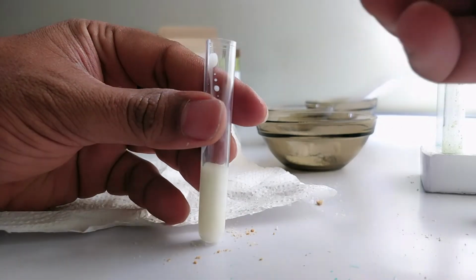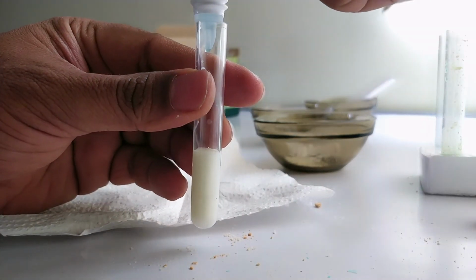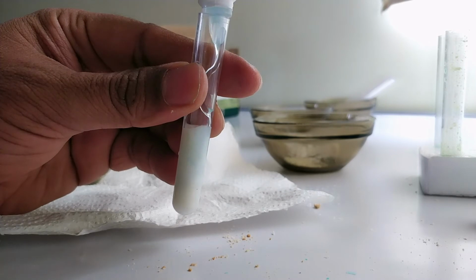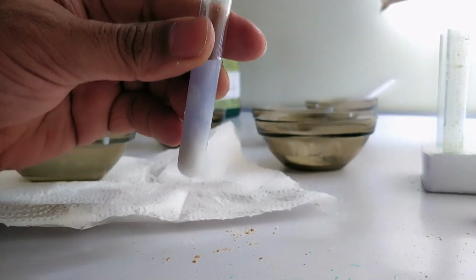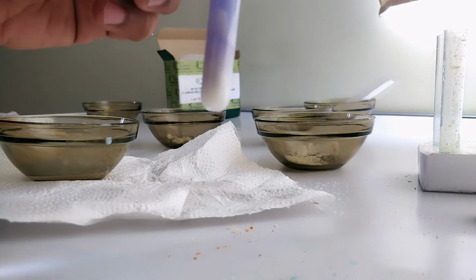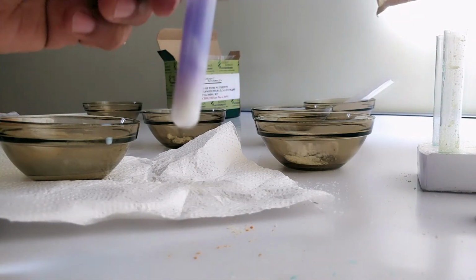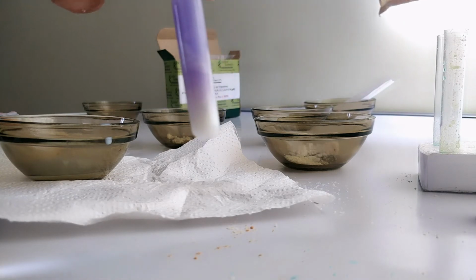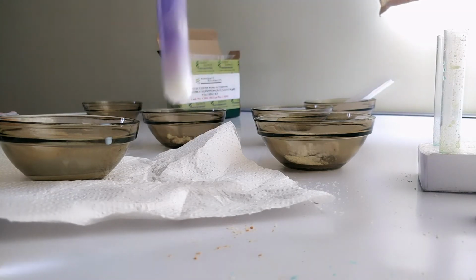Add 6 to 8 drops of copper sulphate, that is protein reagent, into the test tube. This will change the color to violet. The violet means the protein is present in the food ingredients. Yeah, you can see now the milk color changes to violet. So this is the test of protein.